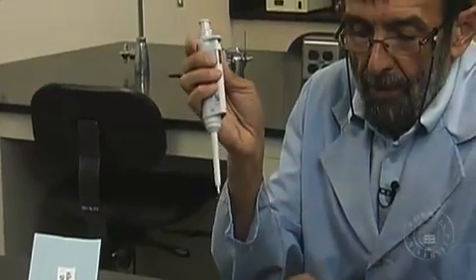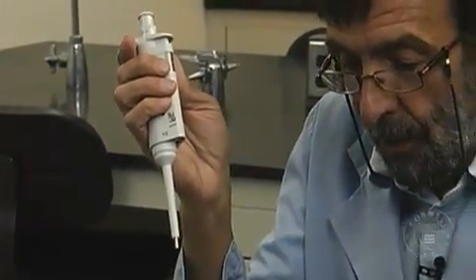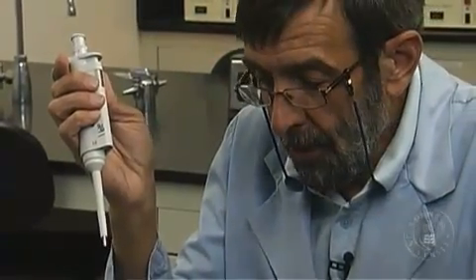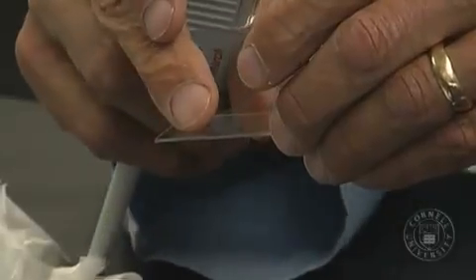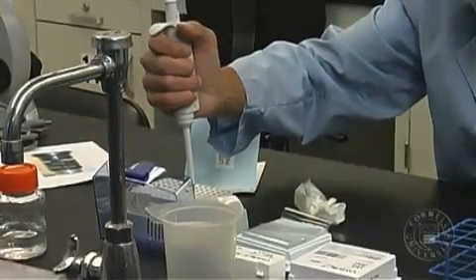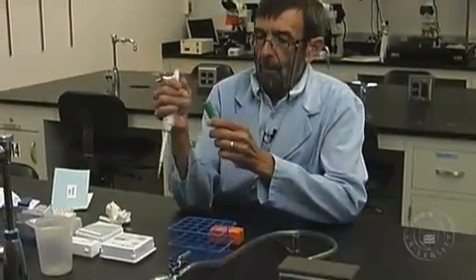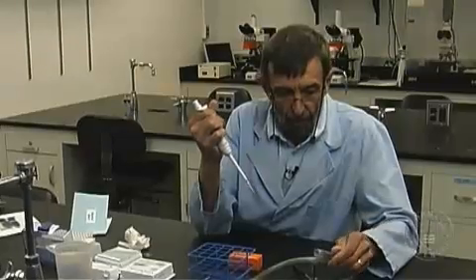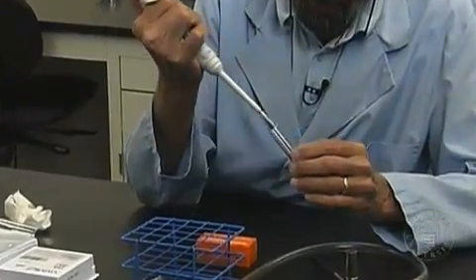I'm going to use a pipetter here that will dispense 5 microliters of that culture, using 5 microliters in order to make a wet mount with this cover slip. I'll take one of these tips, take my culture, and using the flame over here, remove the cap. I'm trying to be aseptic here. Remove 5 microliters.